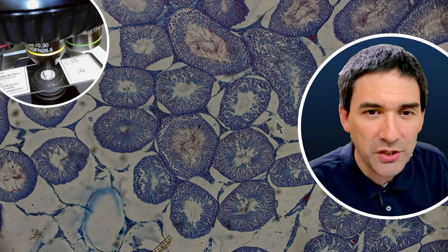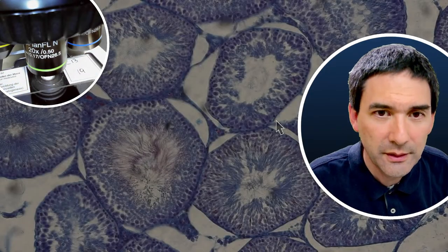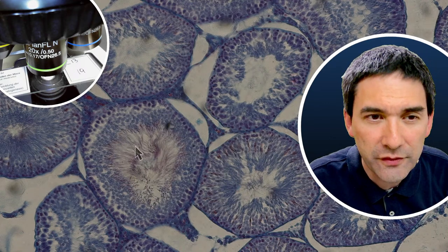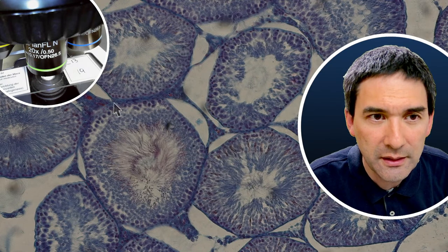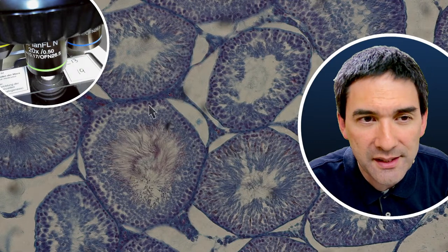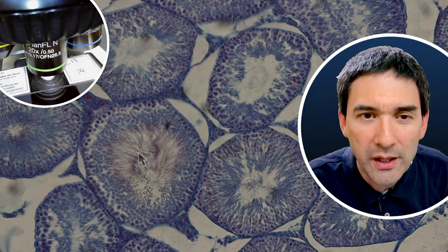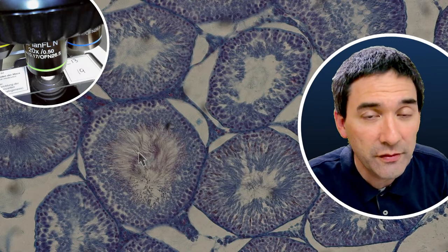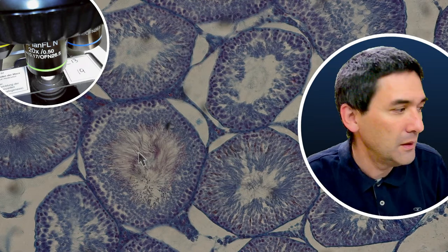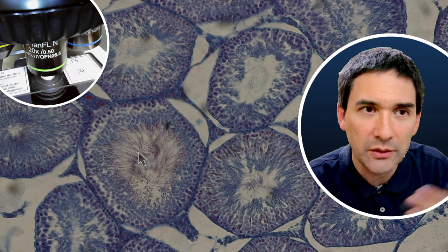And this is basically the places where the sperm cells are made, cross section. This is a so-called cross section of a seminiferous tubule. And what you have in here, those tiny lines that you see, these are the tails of the sperm cells. The sperm cells are being produced as the cells move inwards, and then the finished sperm cells end up in the center here and are carried away. It says here testes of a mouse, but if you look at any other mammal, it looks the same, because on that cellular level, that tissue level, histological level, you cannot really see a difference.